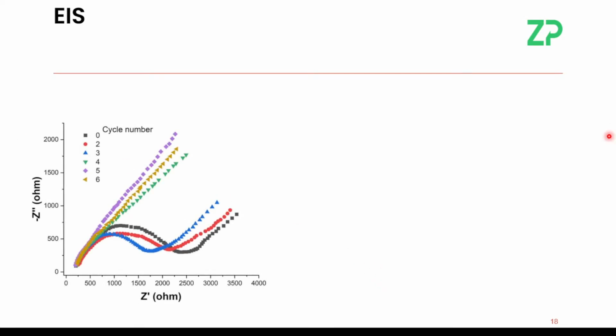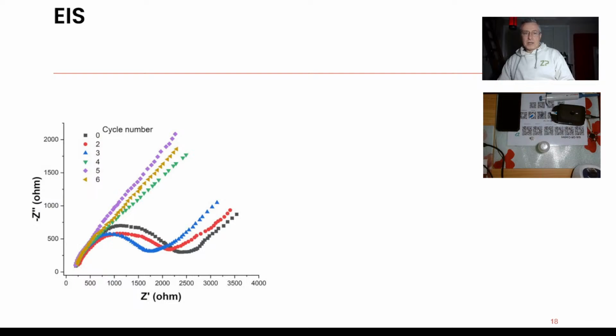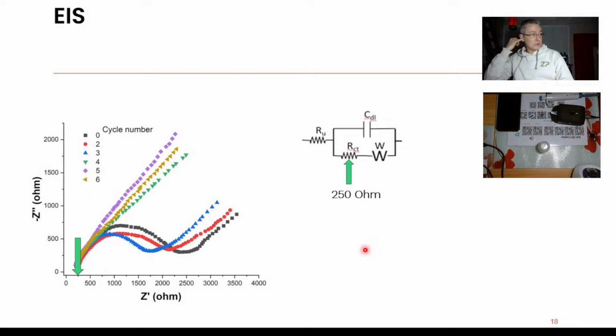Now this gentleman had a second question, which is, I think just, in EIS, you can actually measure this solution resistance. So I'm showing, this is data found in a paper. And if I look at their Nyquist plot, so they're showing their data in a Nyquist plot here. There's a kind of an imaginary semicircle here. And it intercepts the axis here at about 250 ohms. So their resistance here is actually 250 ohms, which is not too far off of that kind of 200 ohms that I was using for my back of the envelope calculations here.